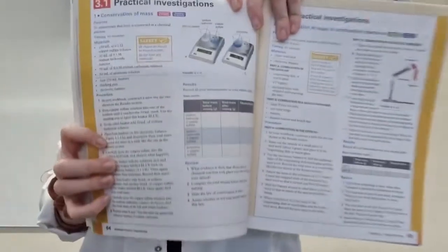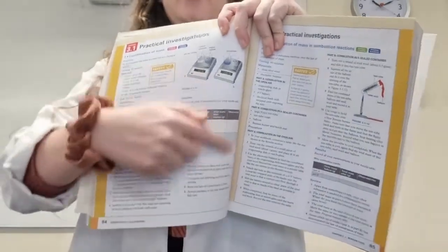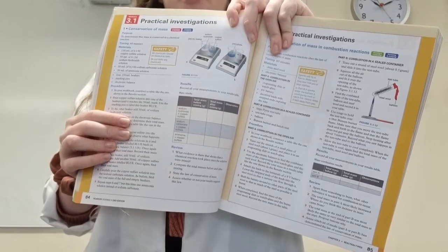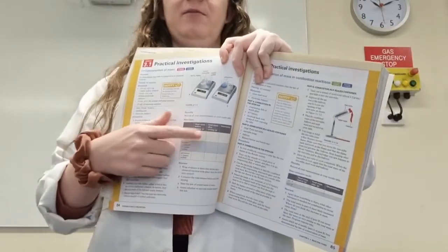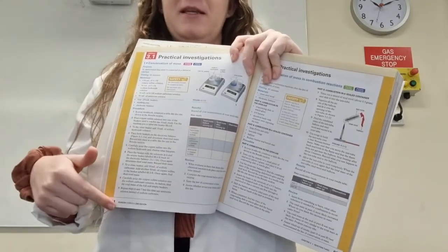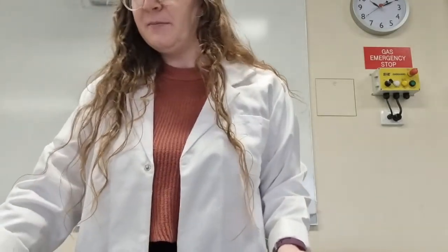So I'm going to do the prac, and you're going to watch it. What you need to do is get page 84 of the textbook up. You need to copy this table into your book. As I go, I will show you what the numbers are, and I want you to fill them in this table, okay? I'm going to follow this method here. You can follow along with me. Open up to page 84 so you can see that.